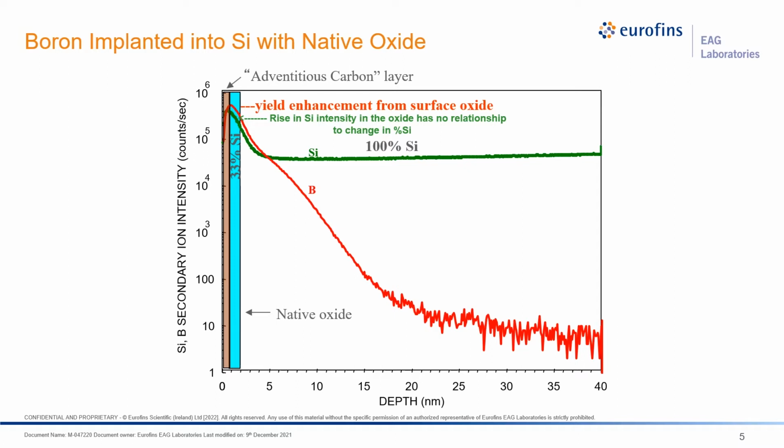But we know in SiO2, the native oxide, we have only one third of the silicon atoms that we do in the bulk. So this illustrates the difficulty and the challenges in quantifying the SIMS intensities. It is going against what you would expect, when you would expect that the intensity of a given ion will decline in proportion to the concentration.